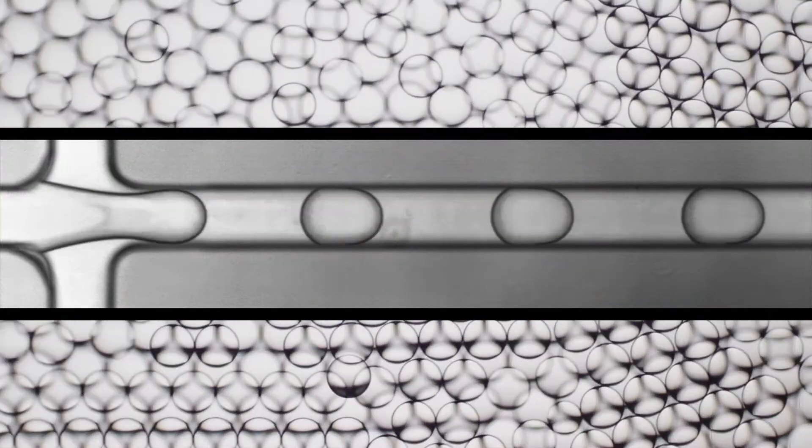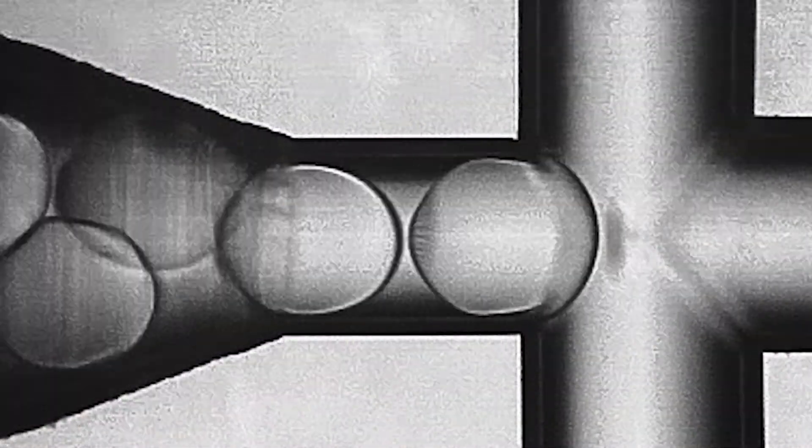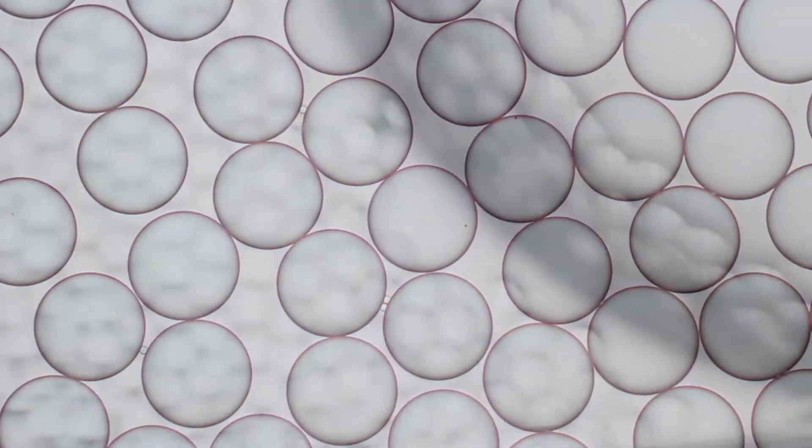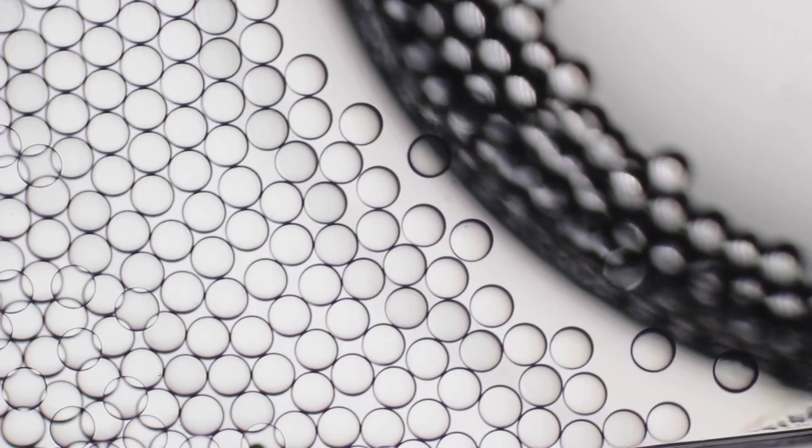It strikes me as a very good way of doing it, this idea that you'd split something up into droplets and you'd then basically put them through a fax machine. Because you can look at tens of thousands, hundreds of thousands of droplets in an automated way. For us to get that information, we would have been here for months.